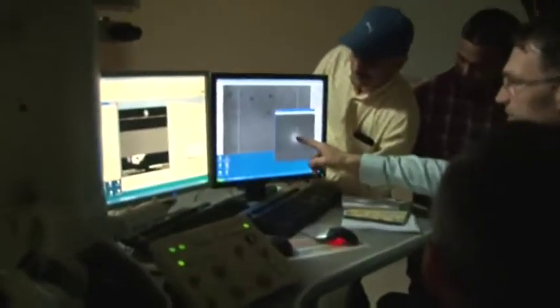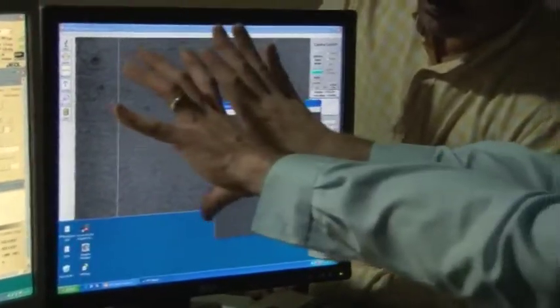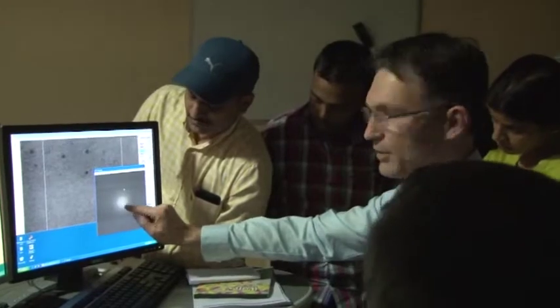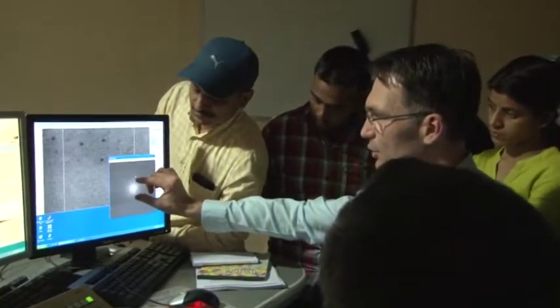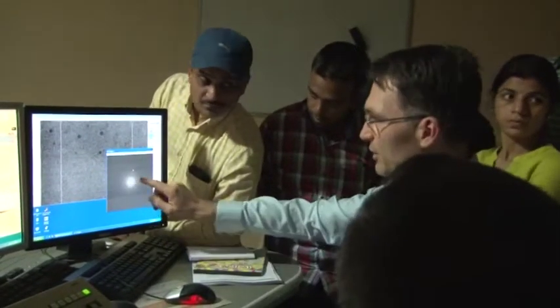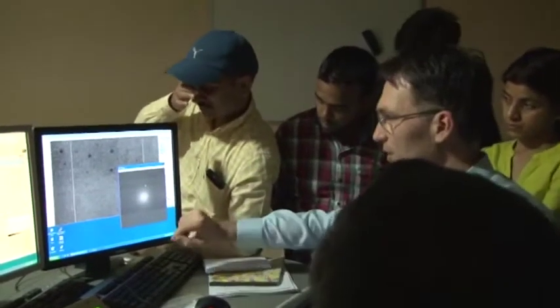And this is the Fourier space, meaning that large object details show up very close to the central point here, and high frequencies resemble very small object details, okay? There is a certain limitation of the resolution, of the point resolution, for such a microscope.